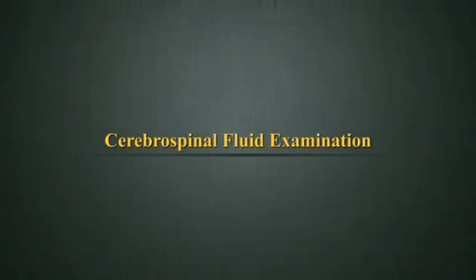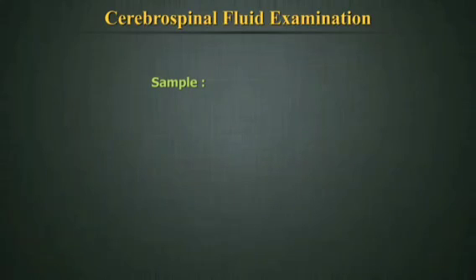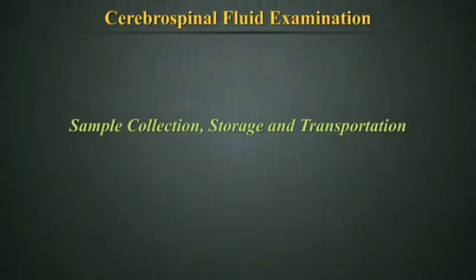Cerebrospinal fluid examination. Cerebrospinal fluid examination is done for diagnosis of central nervous system abnormalities. Samples are obtained by lumbar, cisternal, or lateral cervical puncture or through ventricular cannulas or shunts. Sample collection, storage, and transportation.